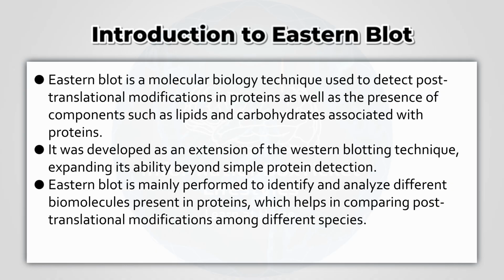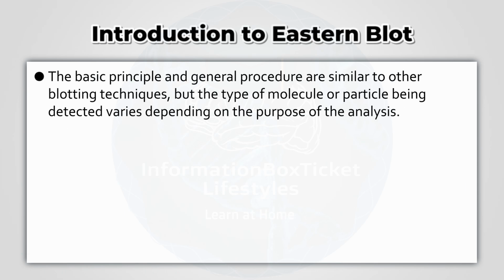Eastern Blot is mainly performed to identify and analyze different biomolecules present in proteins, which helps in comparing post-translational modifications among different species. The basic principle and general procedure are similar to other blotting techniques, but the type of molecule or particle being detected varies depending on the purpose of the analysis.